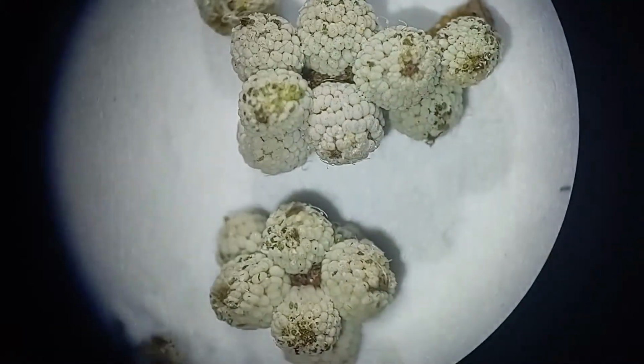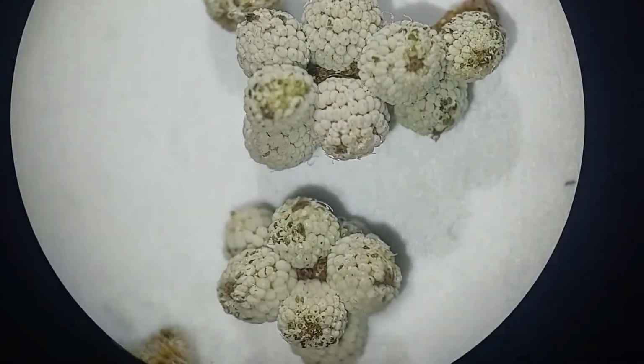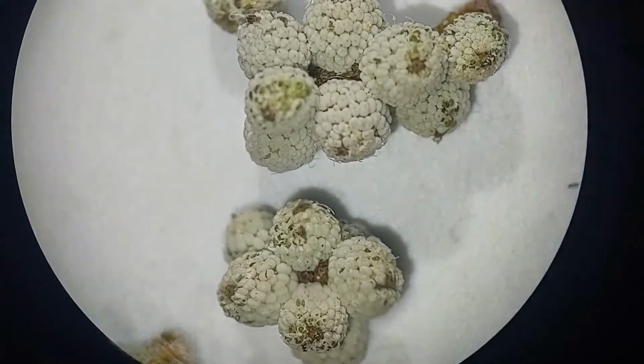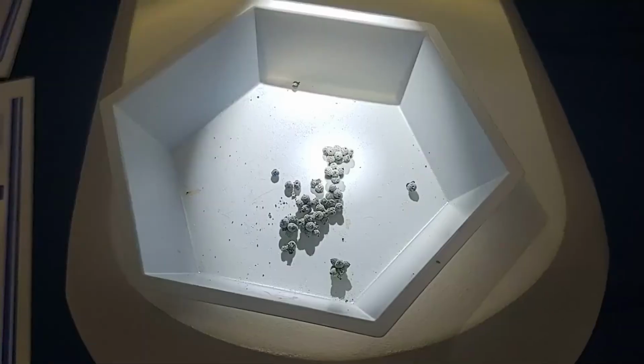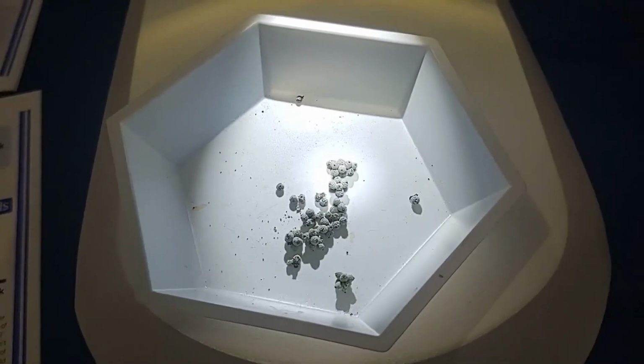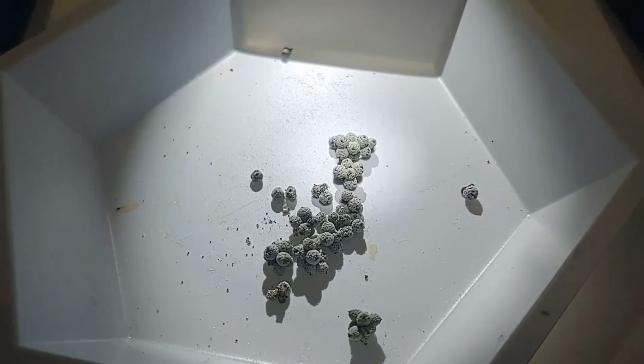A very shaky shot, but these are wax myrtle berries under a dissecting scope. You can see they are covered with balls of wax, and they're quite beautiful. That's what they look like before you magnify them. Not too impressive. But under the scope, they're adorable.